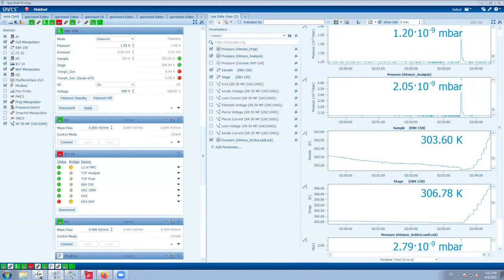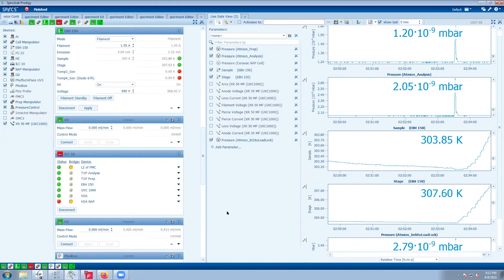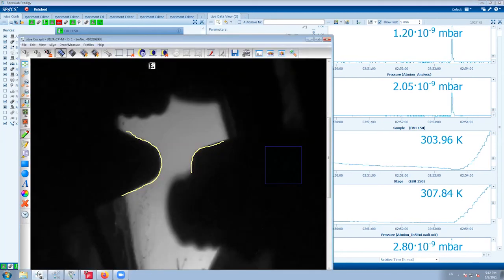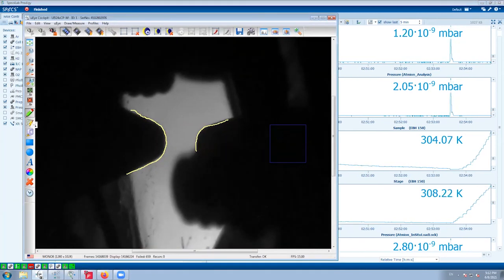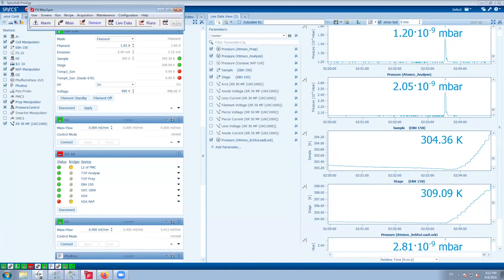It uses some special ceramics, which have some resistive material inside, like wires, so you can increase the current and heat this ceramic. In such a case, maybe it is a bit better because you don't have a very hot stage. You can heat only a small ceramic locally, on which you have your sample holder with your sample. But in this design, it is done in a different way. I mean, there are advantages and disadvantages.